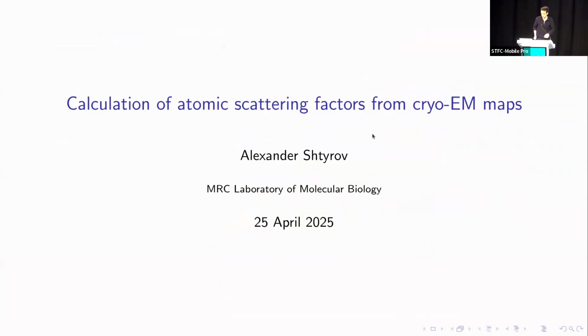Okay, great. So, yeah, today I'm going to talk about some of our work addressing some of the shortcomings of the scattering models that we currently use in order to model electron microscopy data.